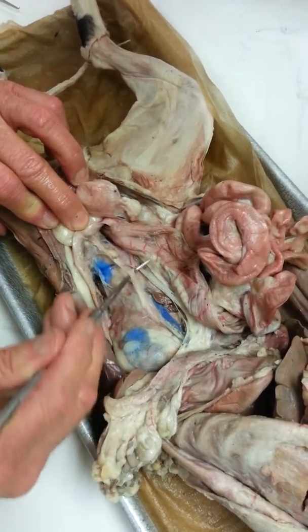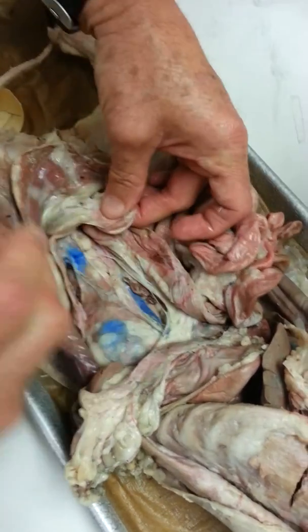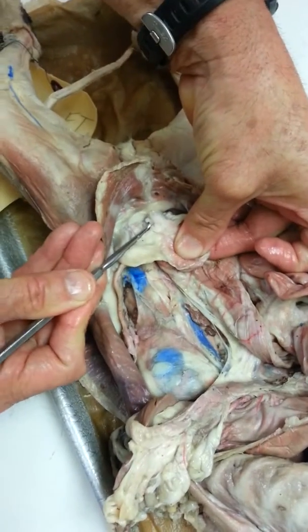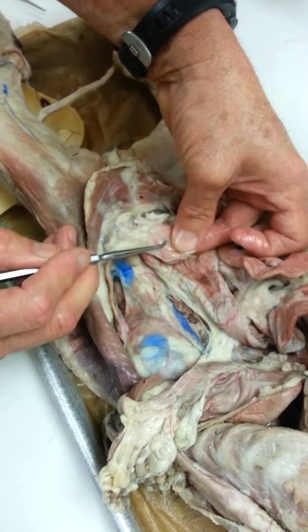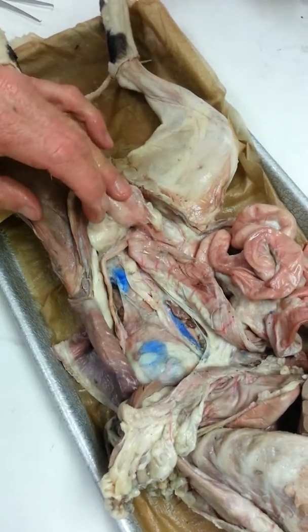So this is ureter. That's the kidney. That's the urinary bladder right here. This structure right here, that little tube, that's the urethra to the outside. So that's all the parts of the system. So urethra, urinary bladder, ureters, and then kidneys.